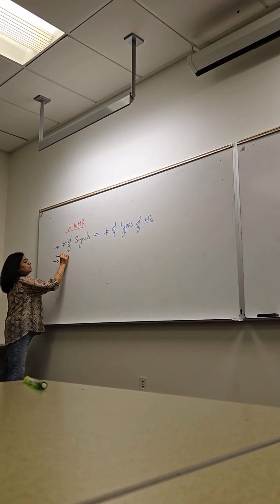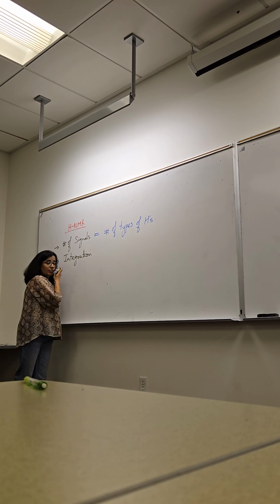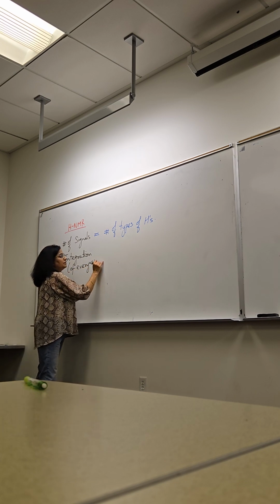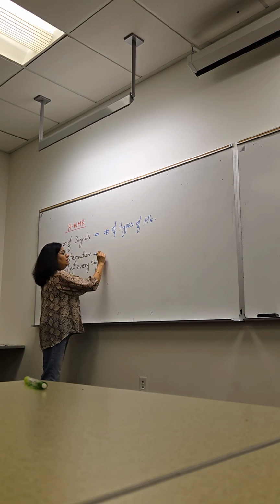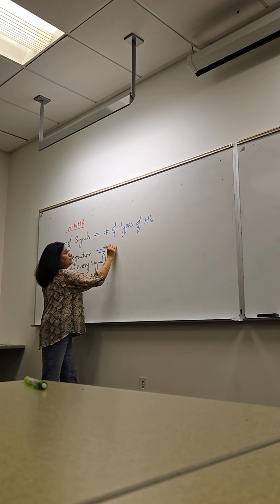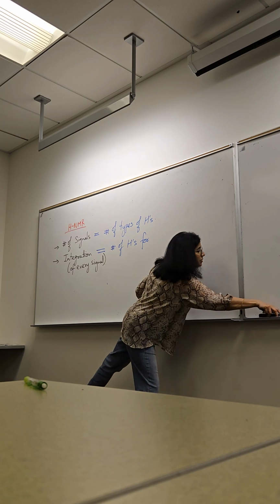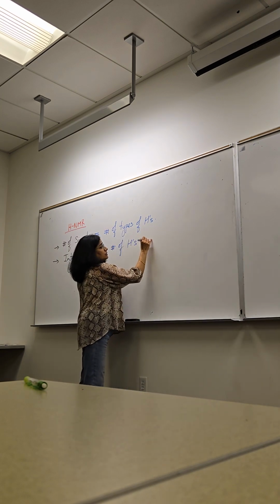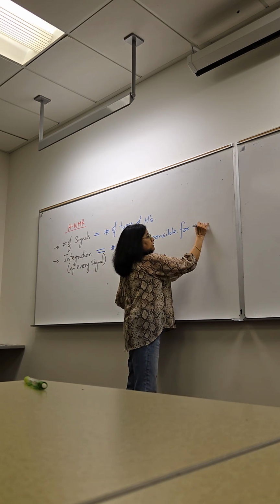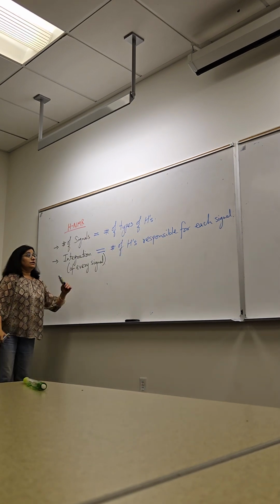Next thing we look at is integration of every signal. Because this gives us the number of H's responsible for each signal. So that's very useful information.